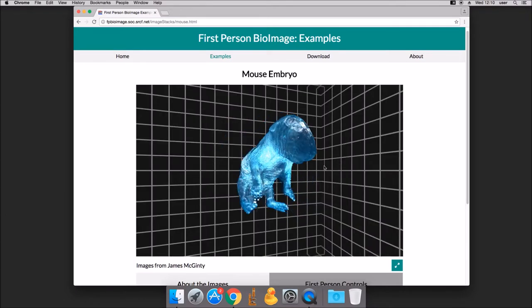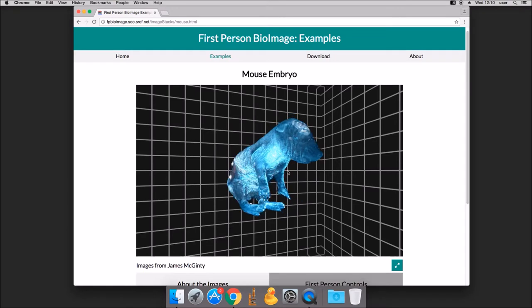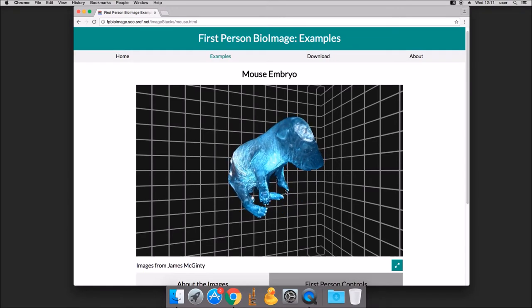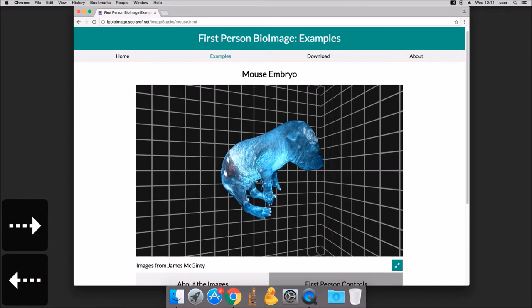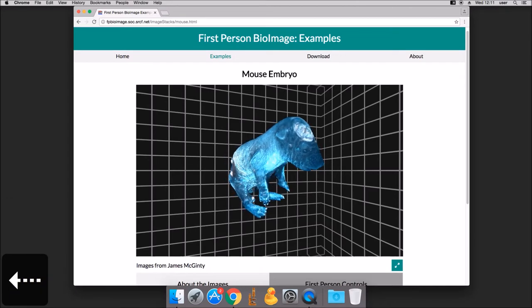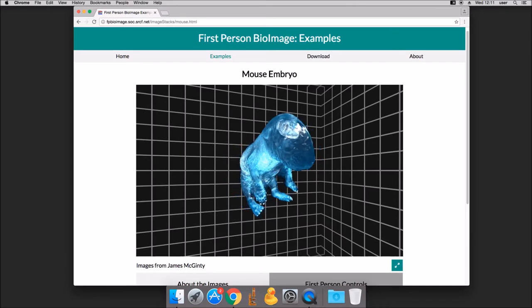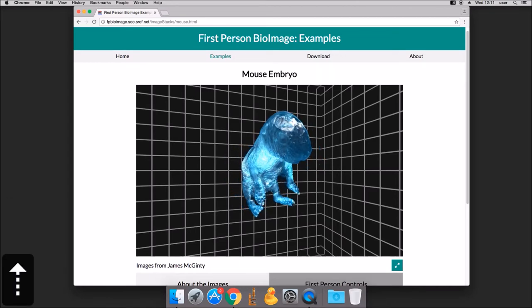Once the 3D data has loaded, you can manipulate it by clicking and dragging with the mouse. Alternatively, you can use the arrow keys to rotate the model.